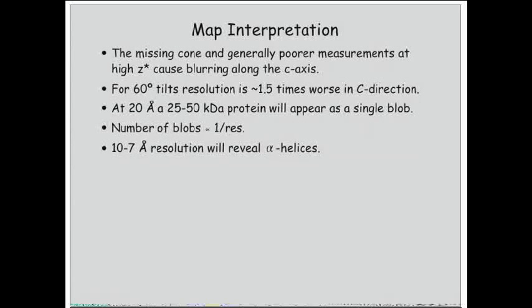Okay, so I'm just going to finish off with some final thoughts and observations. You'll be looking at this in more detail, but just some thoughts about looking at maps, which are just things that I've kind of over the years, just talking to new people that have come into the lab, trying to show them how to do image processing and look at structures. You're always going to have poorer data in that vertical direction. So you're going to get blurring in the vertical direction.